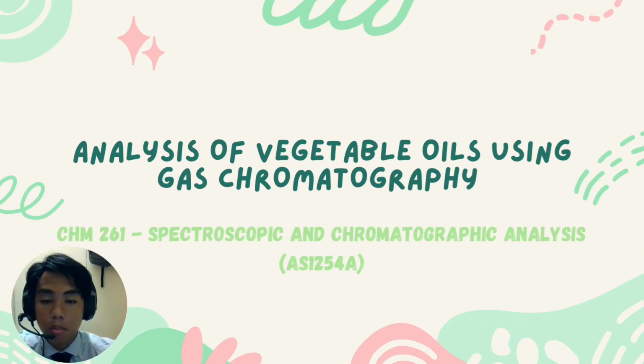Analysis of vegetable oils using gas chromatography. This presentation is for subject CHM261, which is spectroscopic and chromatographic analysis, and we are from class AS1254A.